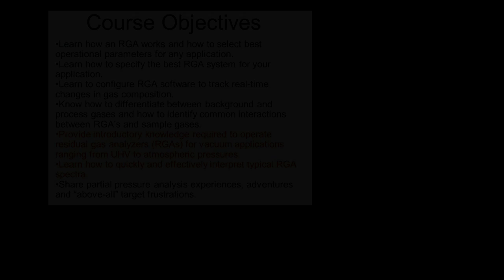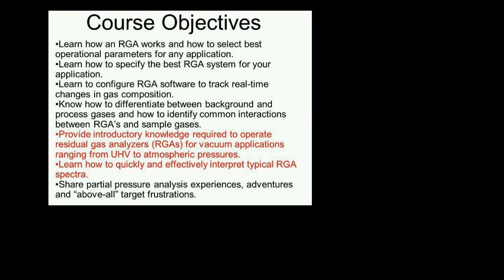We will learn how to specify the best RGA for your application. So if you are in the market to buy a new RGA, or you need another RGA and you don't know exactly what you should buy, hopefully by the end of this presentation you'll have a pretty good idea what will work best for you.